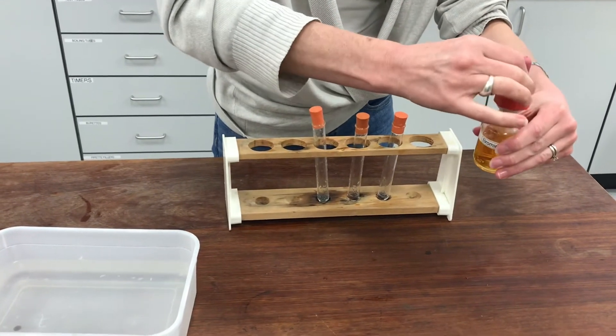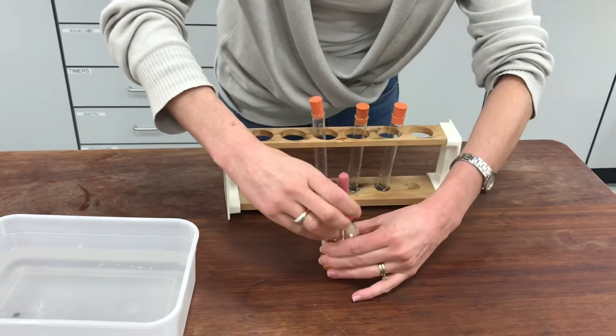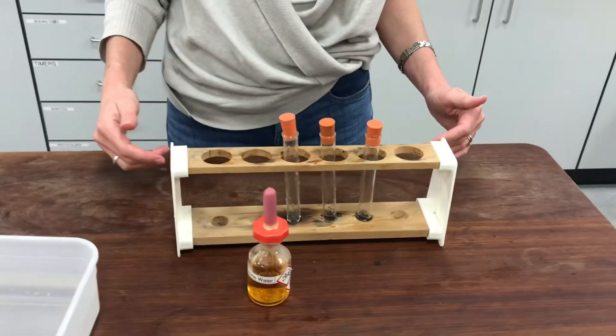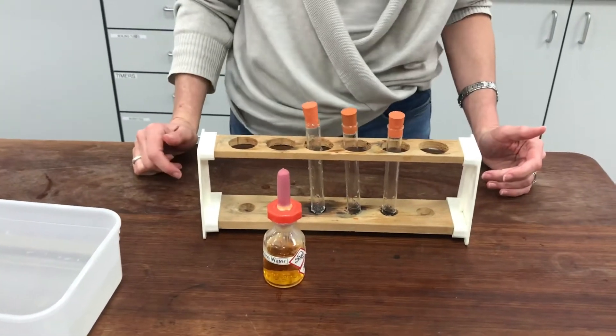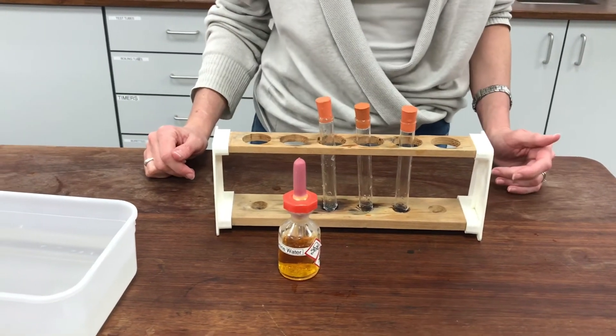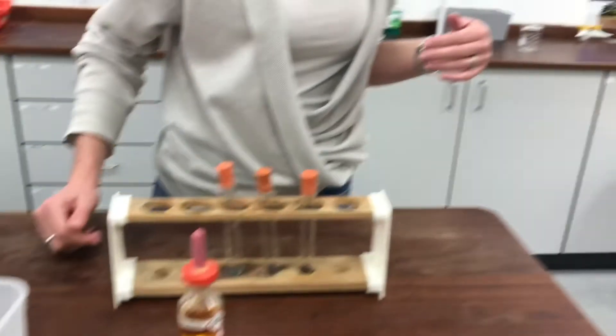Now you'll remember from experiments that we did before that when you put bromine water with alkanes they tend not to do anything unless you've had a lot of UV light go on them. Well, it's evening now and I'm in a lab with the blinds down and it's dark outside there's no UV light around.